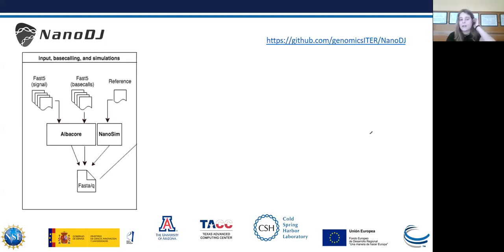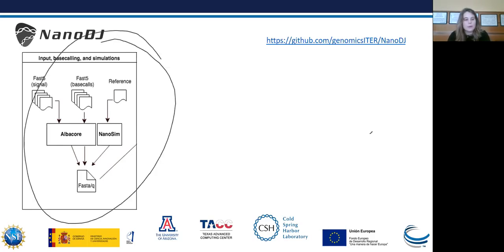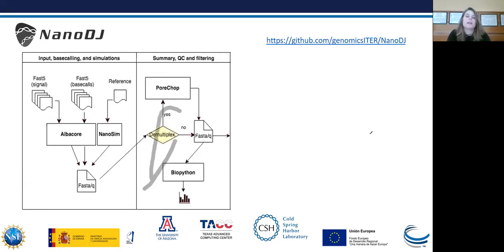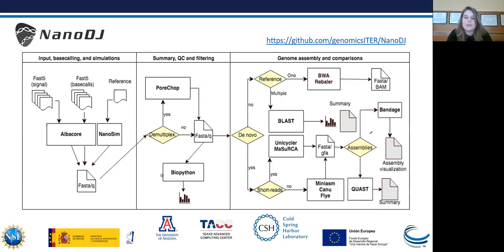This is the workflow of NanoDJ. We can start with a Fast5 file and do the base calling with Albacore. Nowadays, the base calling is carried out with other software called Guppy while the sequencing is occurring. So you can start also with a FASTQ file. You can also start with simulated reads using NanoSim and a reference genome. Then there are also demultiplexing steps and quality control steps using BioPython. And you can also do an assembly with the two methods mentioned — sequence alignment or de novo assembly.